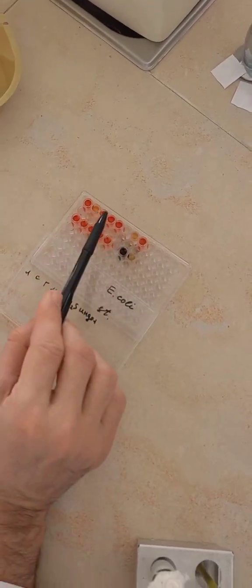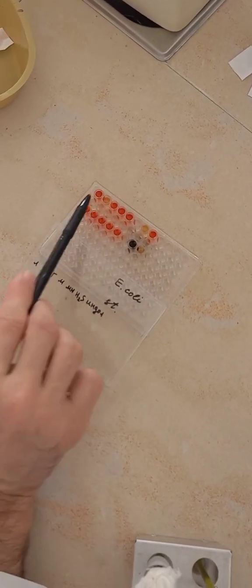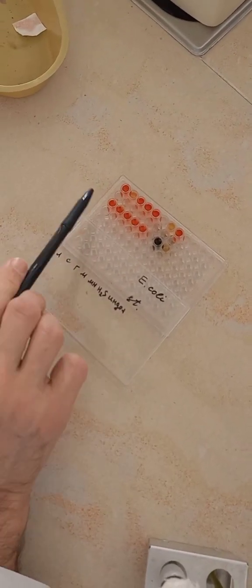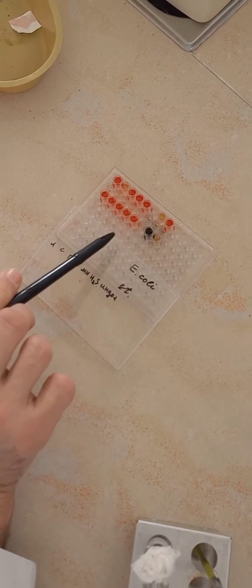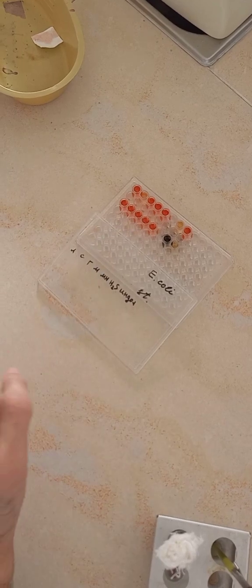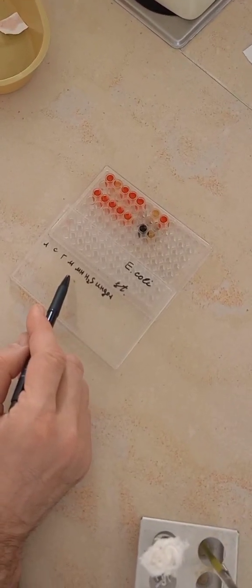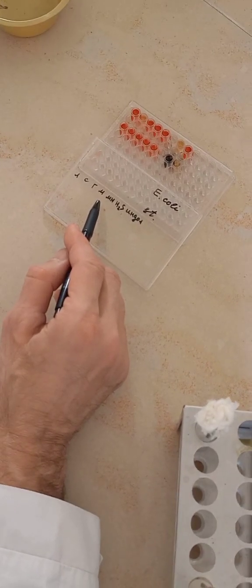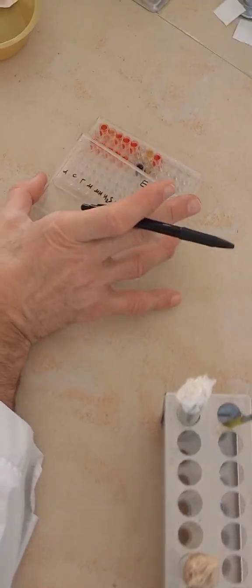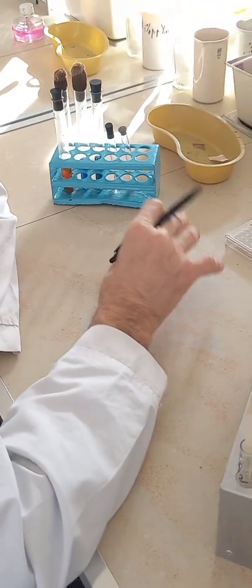Now taking everything together. So for E. coli, only sucrose is not fermented. Sucrose, second one, sucrose. And all 5 sugars are fermented for Staphylococcus. Now, people, let's forgive microbiologists: mannitol is not a sugar, but in microbiology we speak about it as a sugar, as a carbohydrate. In reality, it is a polyatomic alcohol. Is it clear? Okay.